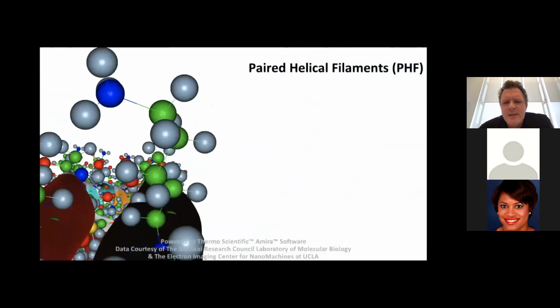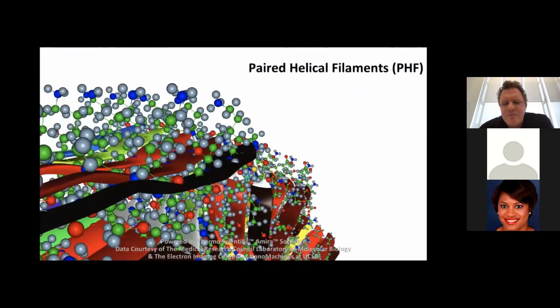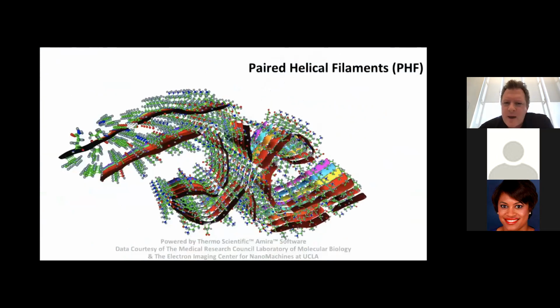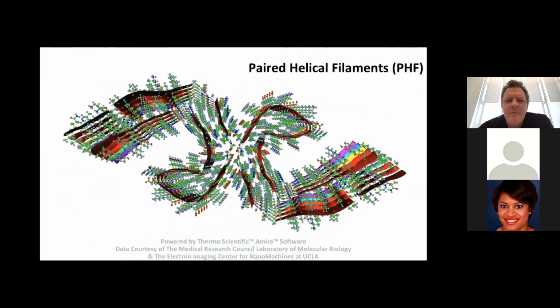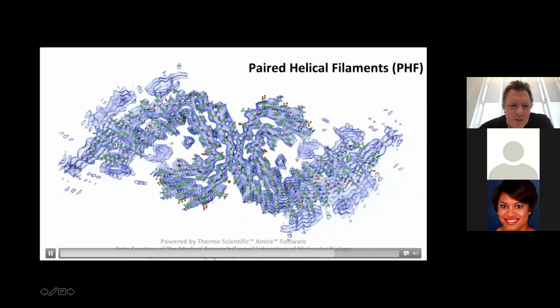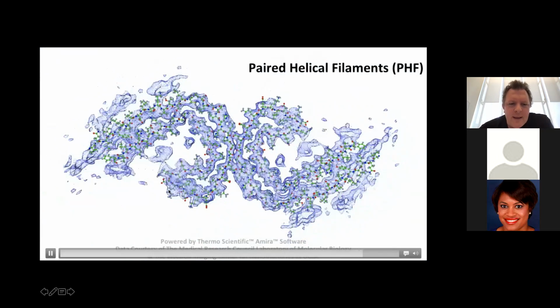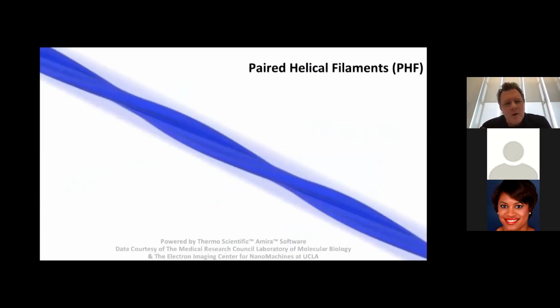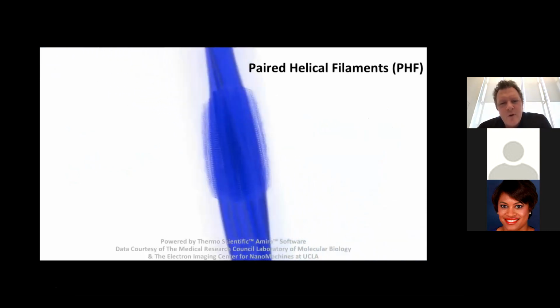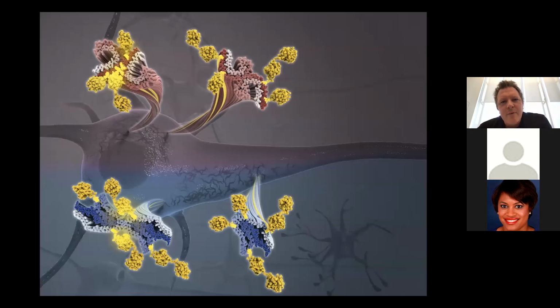And I think this is an incredibly powerful technique that still has a lot of discovery and mileage to go in terms of solving important protein complexes. So you can see here, these little bumps are actually real side chain densities. And the different sizes of those side chain densities allow us to build an amino acid model of the protein directly into the Cryo-EM map.